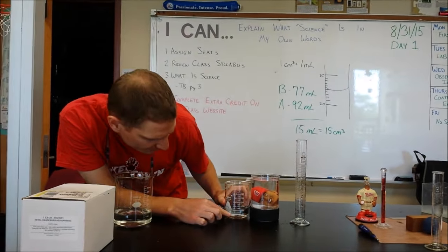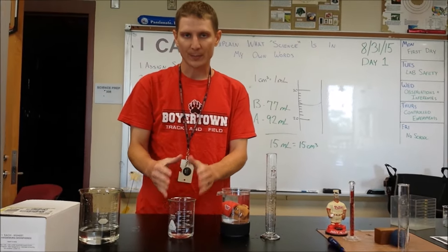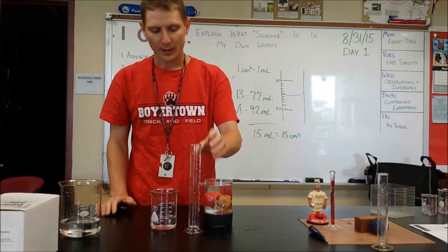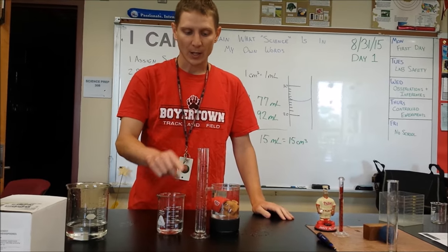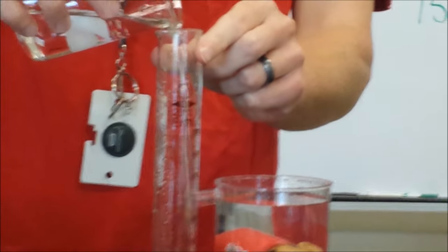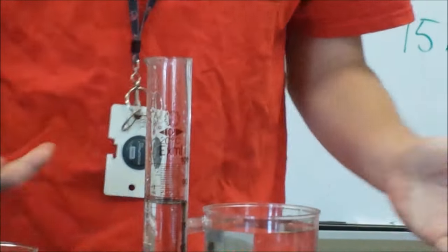Now, here's our problem. Right now, we're close to 150 milliliters, but we do not use beakers to measure volume. They're not precise enough. We're always going to be measuring volume of a liquid using our graduated cylinder. Now, knowing that we have about 150 milliliters in here, we're probably going to have to fill this twice. So let's get our first one here. It doesn't really matter where I stop, as long as I remember my first number.